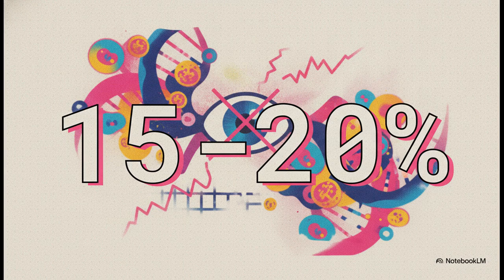If your massive, complex bioinformatics pipeline accurately identifies a crucial somatic mutation at a 5% frequency, and you try to validate it in the lab using Sanger sequencing, the machine is going to completely miss it. The technology just isn't sensitive enough. It's essentially blind to the exact cancer mutations the somatic pipeline just worked so incredibly hard to uncover.